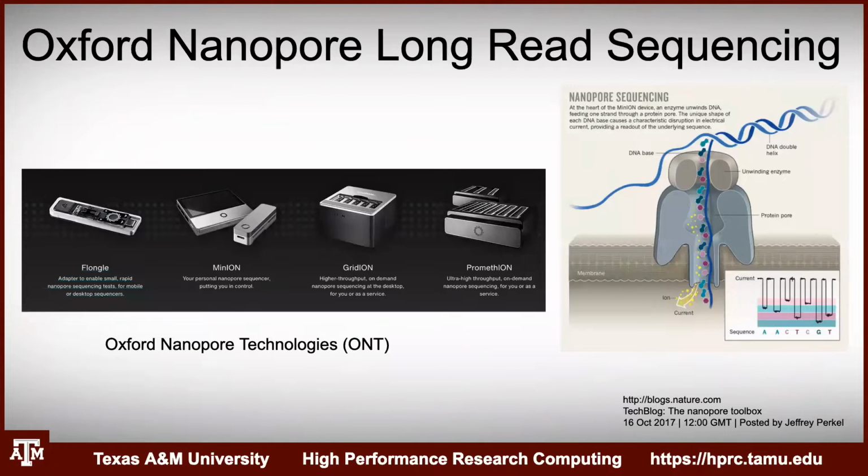Another really interesting, relatively new sequencing technology is the Oxford Nanopore. Have you had any experience with this or done any nanopore sequencing? I love this bit of technology. It's really cool. They range in different sizes. The Flongle is the smallest, and they go up to the PromethION, or however you pronounce that. Essentially, all this is doing is taking essentially untreated DNA, and you put it directly on the flow cell, and then you can run sequencing on your laptop. It's really great, and it's got a lot of uses.